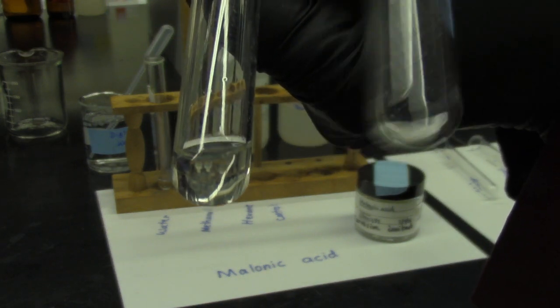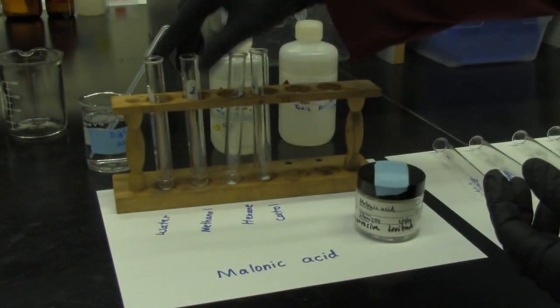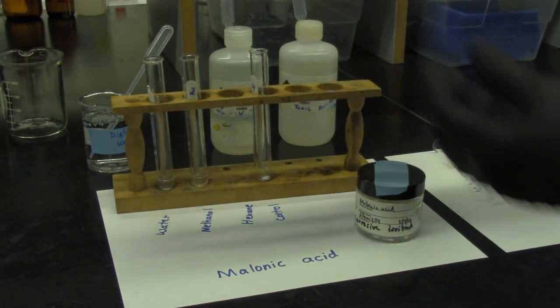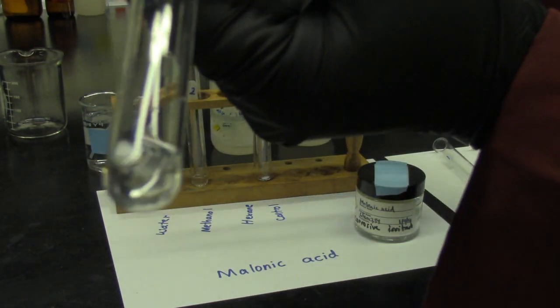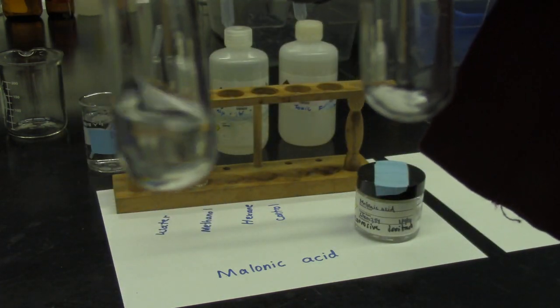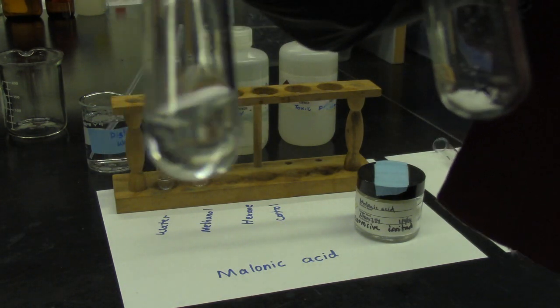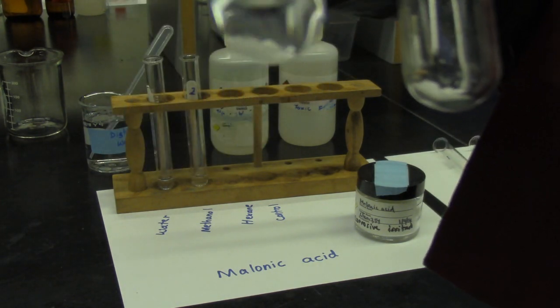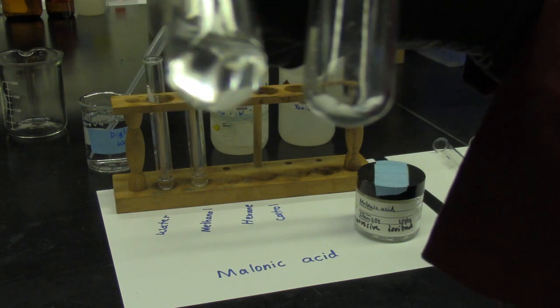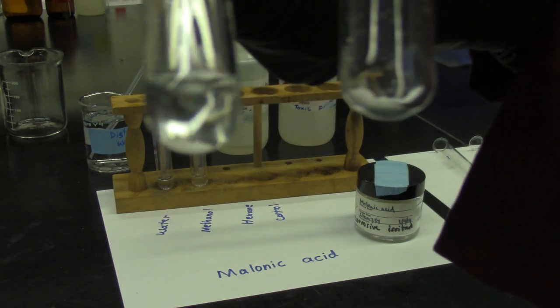You see the solid in the control, and the solution. Test tube number 3 is hexane. Compare with the control. You see the solid at the bottom of the hexane.